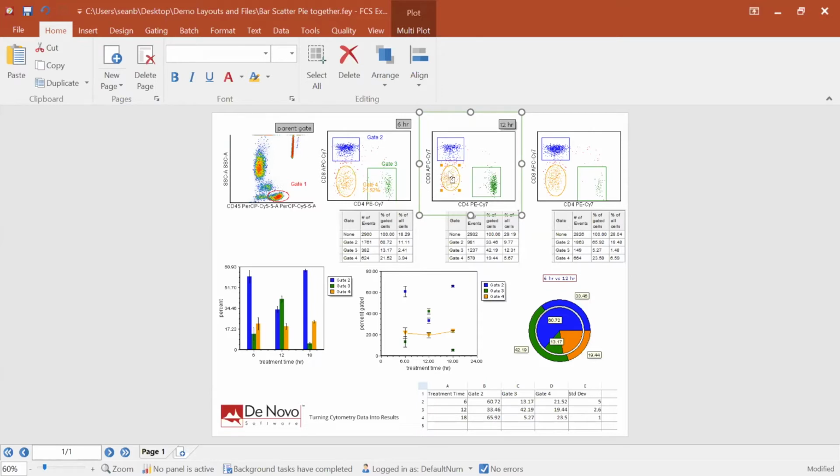But again, what we can do here is just move that gate, see how that makes a difference. And I kind of like this little scatter plot. It looks like a happy face, right? It looks like we're pretty happy there. And if you kind of move this around, I think we can make it sad too at some point, right? So that's not where we want our gate.